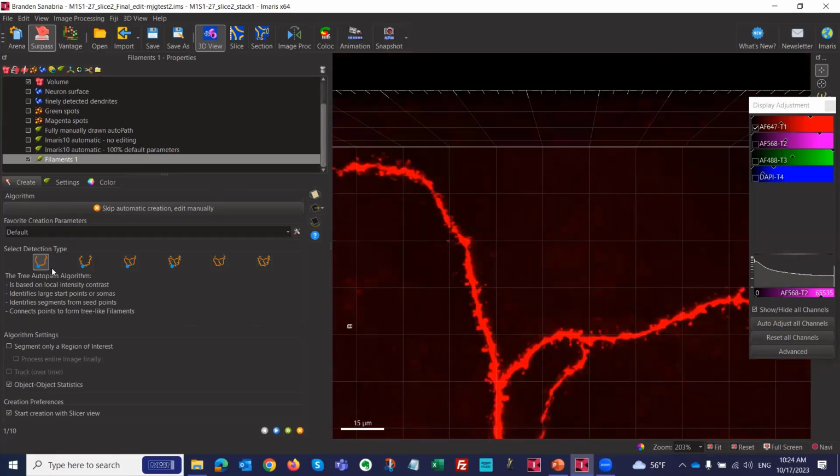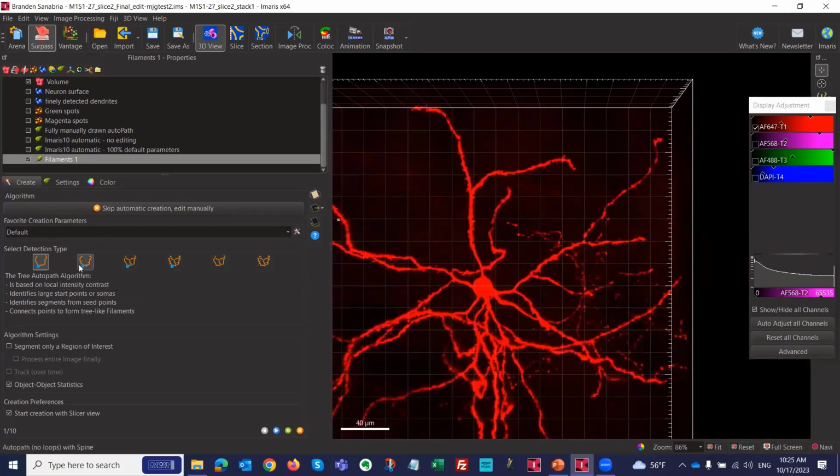But I will not focus on the spine analysis. I will want to show the machine learning inside the filament tool for the segmentation of the dendrites. And I will use the first guy here, the first step. So we have a cell body, a starting point, and we have dendrites, okay, or filaments, but no spines. Spines would be this guy, and then we have 13 steps. I'm going to use this guy here.